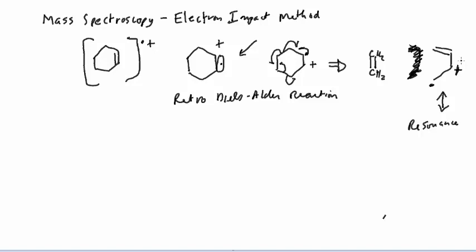That is, to look at the mass spectra for these classes of compounds and to comment on some of the general kinds of peaks that we see. Next, I'd like to look at alkanes and examine the type of electron impact mass spectra they generate.